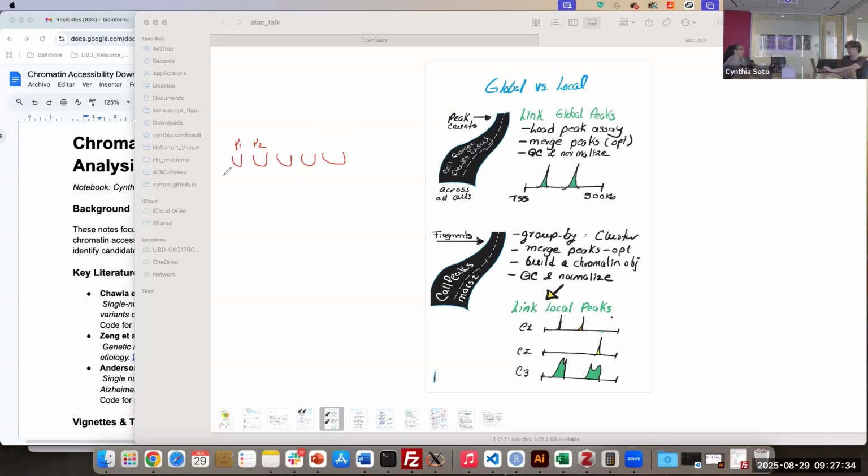So when I integrate this data in order to identify, let's say, multiome clusters, what the merge function of CellRanger is doing is gathering all these peaks in one common matrix. So I'm not merging specific peaks detected for each one.